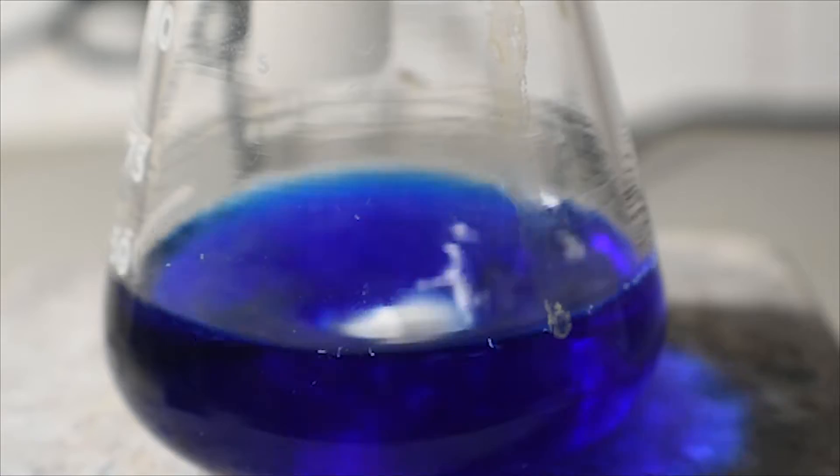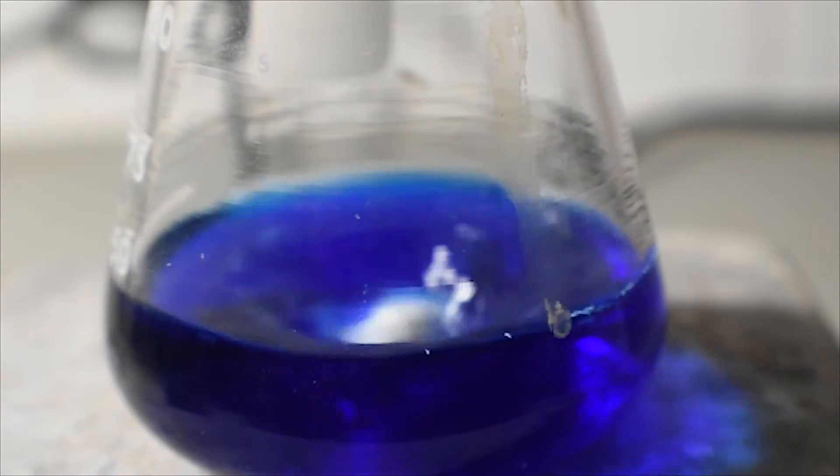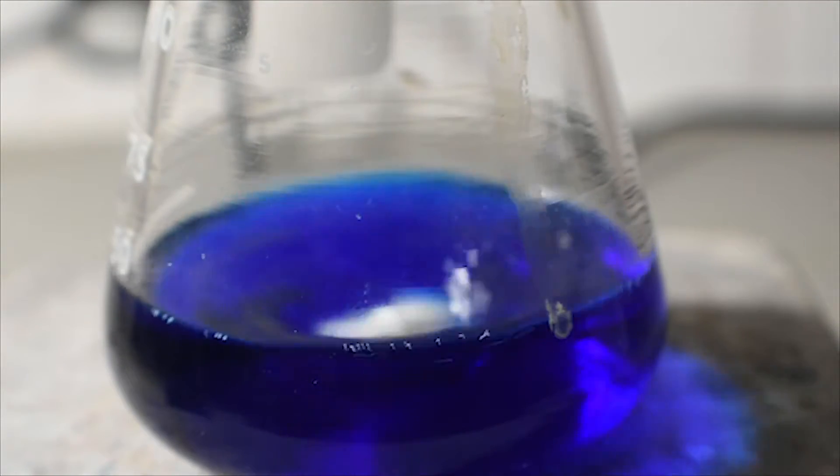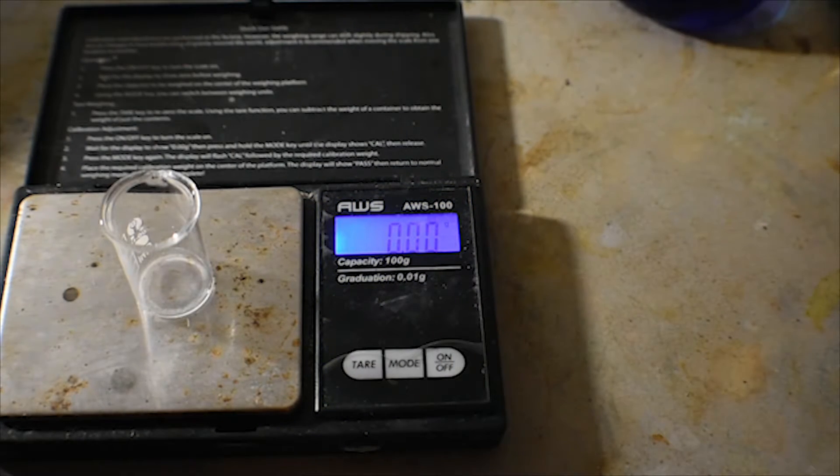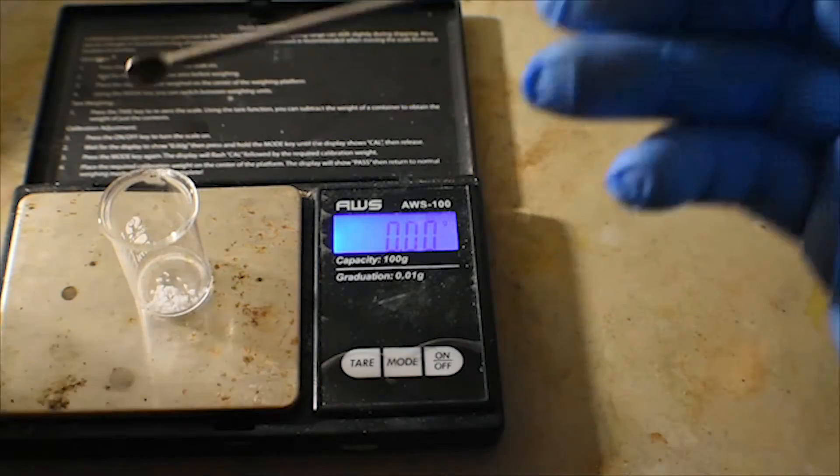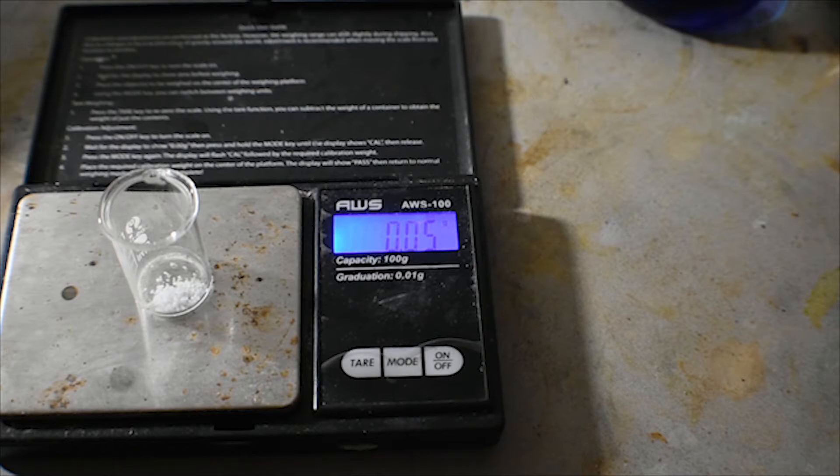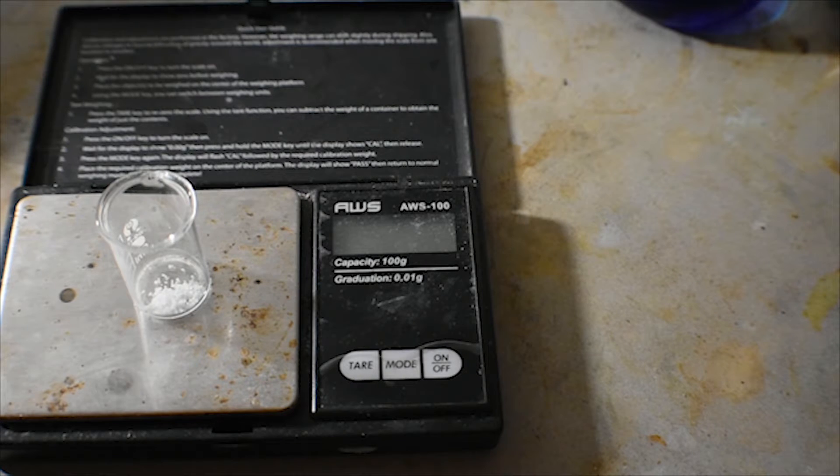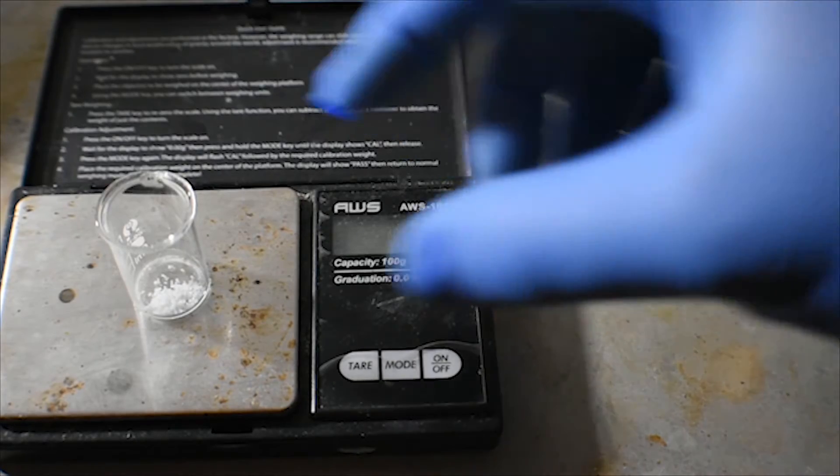What I'm going to do now that the temperature has reached 67 degrees, I'm going to take it off the hot plate and let it cool down to 30 degrees Celsius. At this point, I'm going to go ahead and weigh out the 50 milligrams of sodium borohydride. It may seem amazing to you that this small amount of borohydride may be able to reduce all of the cobalt-2 to cobalt-1. It might not be able to. This is my first time doing this, so we'll both see. If it doesn't reduce it all the way, then I will add more borohydride until I'm satisfied. But for now, I'm going to start with this.